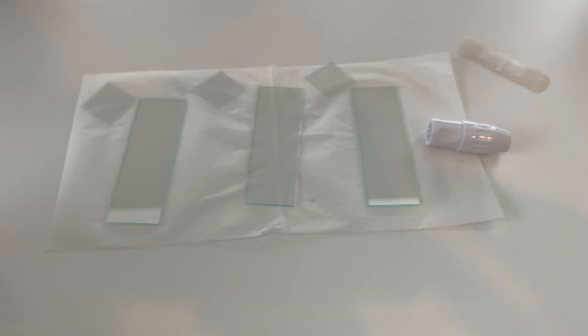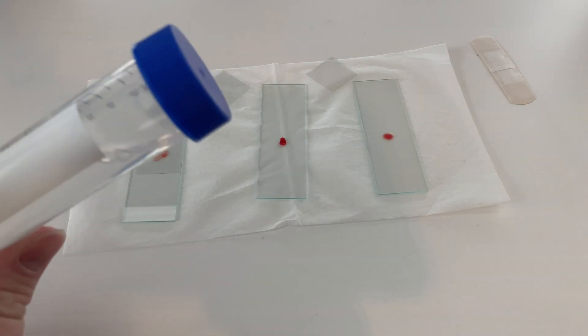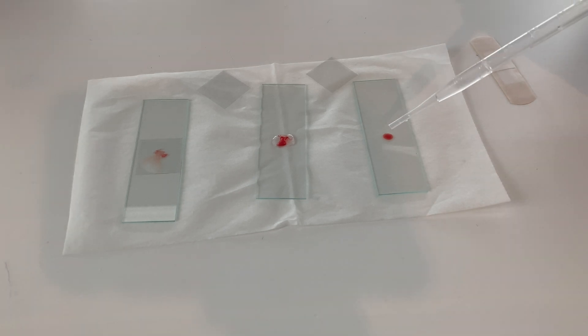You'll see here I have three different slides and on these slides I'm going to put some drops of blood. For the first slide I'm just going to put a cover slip on there and it's going to be our control. The second slide is going to have a water solution that has a lot of salt in it, and the third one is just going to have a drop or two of just regular water. Now let's go ahead and look under the microscope and see what our blood looks like in each of these slides.